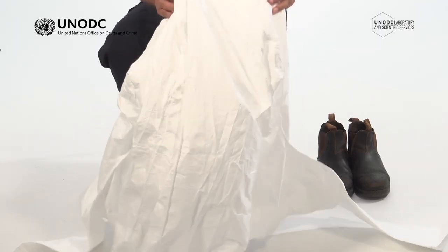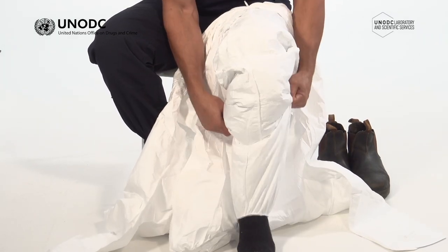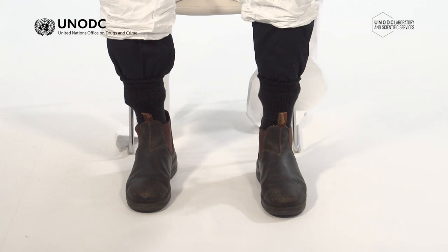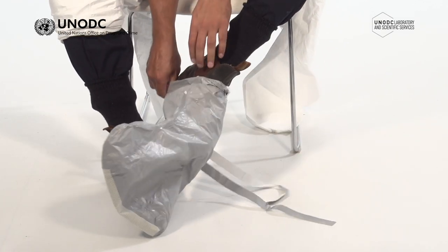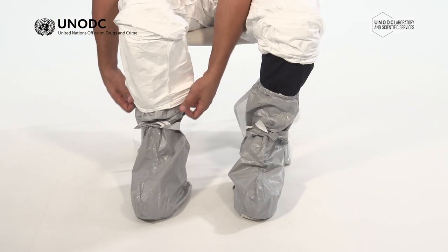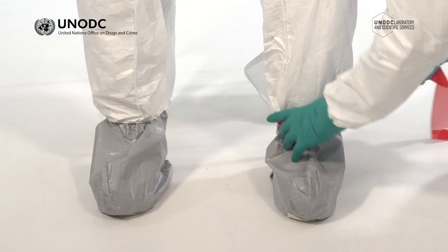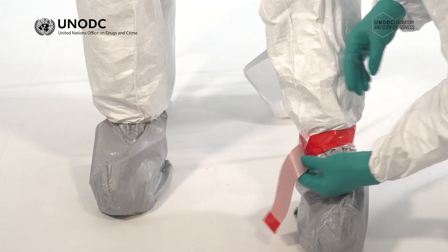Remove any footwear and tuck any long pants into your socks. Put the suit on starting with the legs. Put on the disposable overboots or whichever type of protective footwear is appropriate for the environment in which you'll be working. Pull the legs of the suit down over the top of the overboots or any boot type footwear being worn. At Level D, it is not always necessary to tape boots to the suit; however, if required, this can be done now.